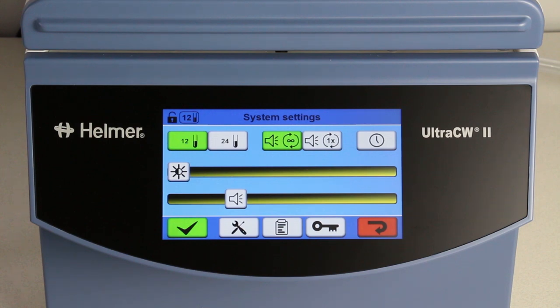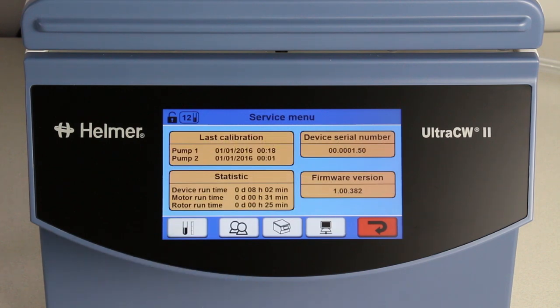To check and adjust calibration, touch the tools button, which takes you to the service menu. On the service menu screen, select the ruler icon.